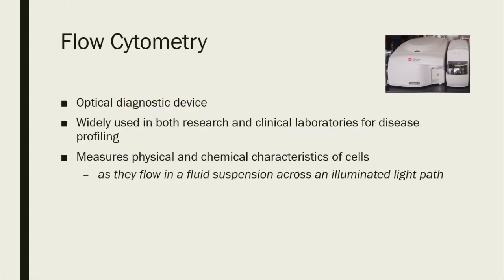Alright, so moving on to the main thing here, we're talking about cells, using an instrument called flow cytometry. This is an example of the machine. It's pretty bulky. This is really an old model. Newer models are a little bit smaller, but there is a good size that comes with it, and I'll explain what is involved in those.